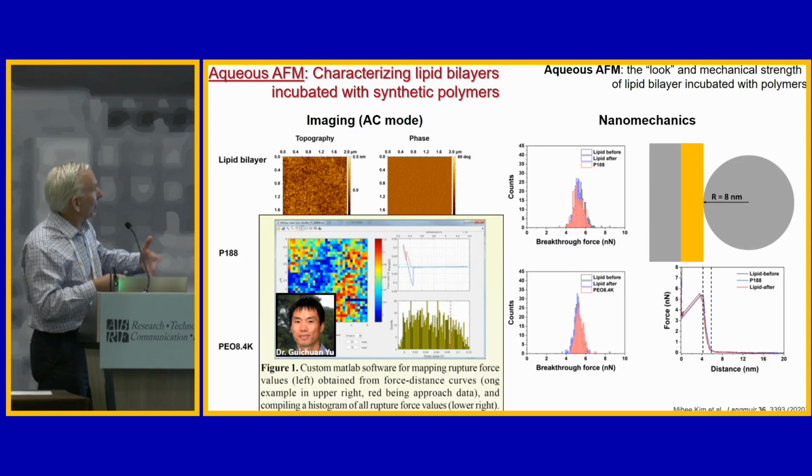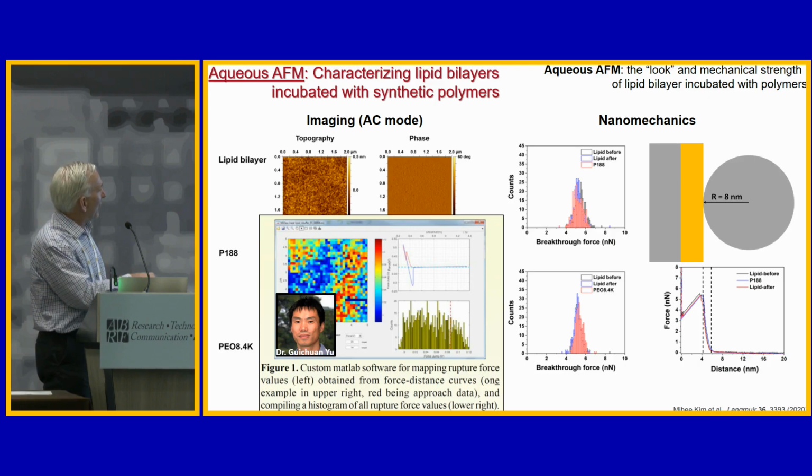And actually earlier in the project, we discovered that we were not preparing our samples properly. They were actually seeing air for just a fraction of a second before they were re-immersed in liquid. And that actually gave us quite a heterogeneous surface with a broad range of rupture forces.